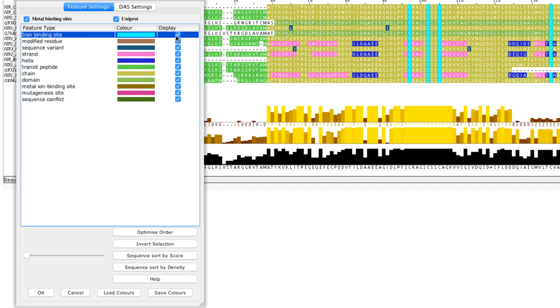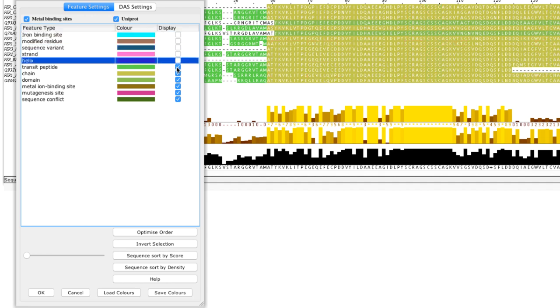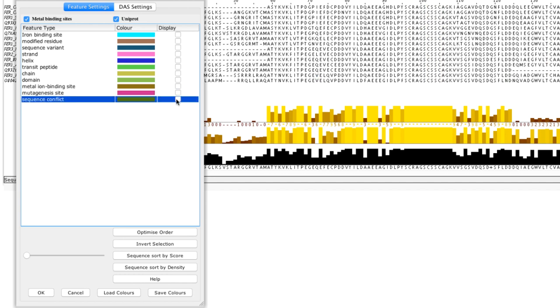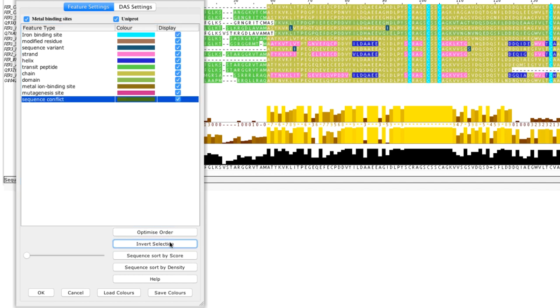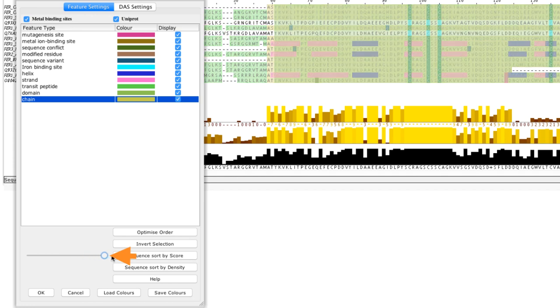I can untick boxes in the display column to hide features. Clicking on the optimized order button reorders the sequence based on the average length of each feature type. Dragging the slider alters the transparency of the feature.